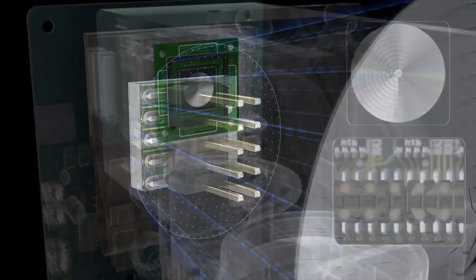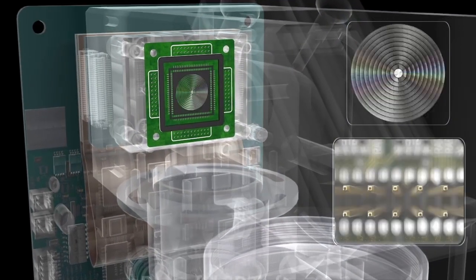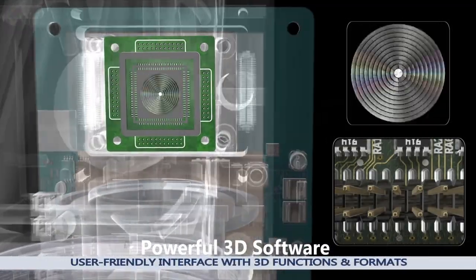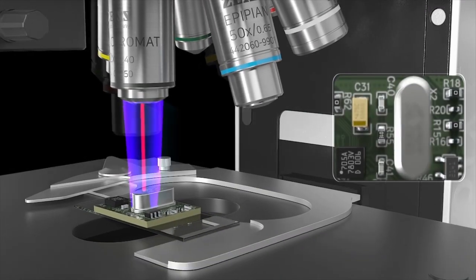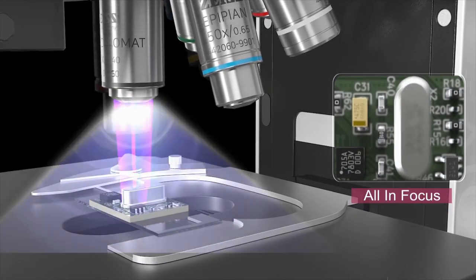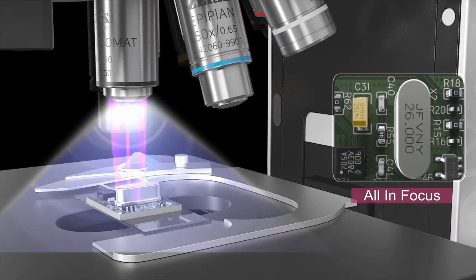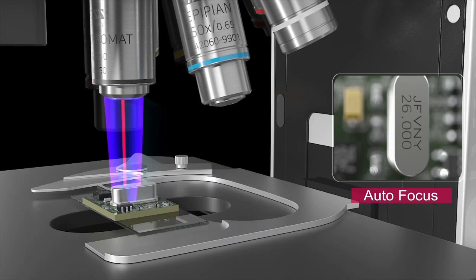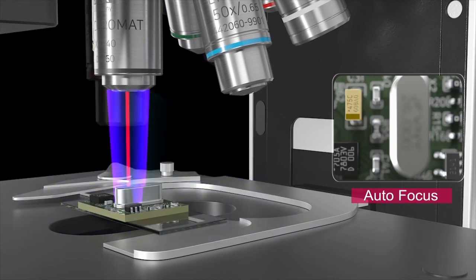Wisetopo provides ideal features in combination with our developed software. These features let users have a better understanding of an object in real time. Wisetopo provides an all-in-focus function where everything is in-focused. The autofocus function automatically focuses on the region of interest.